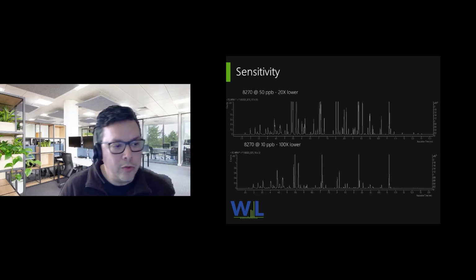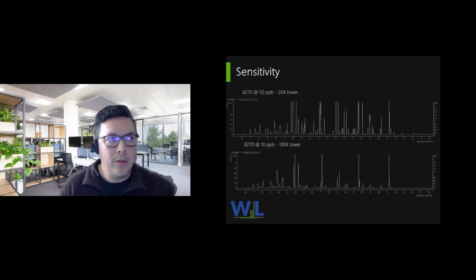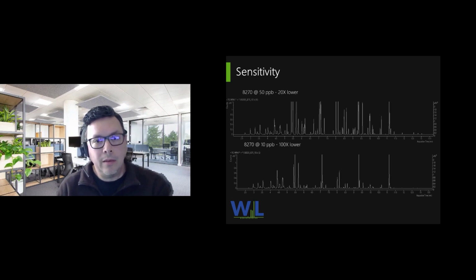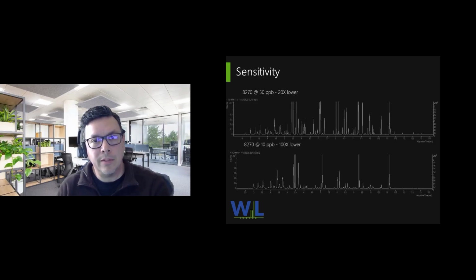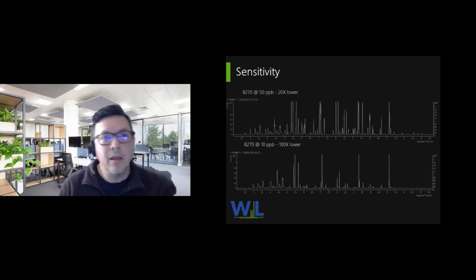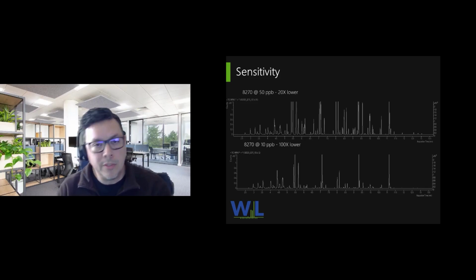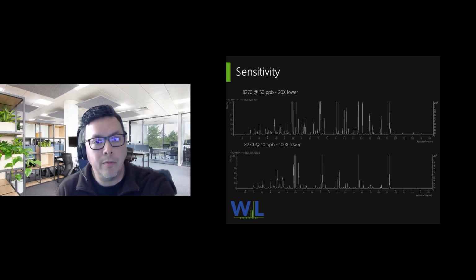And to circle back to the DCM band, we would need to use less methylene chloride, but we would also need to decrease the sample mass, or the mass that we're using. Using the column, having the ability to see 20 times lower, 100 times lower, really opens up a lot of opportunities, a lot of things that we could do, and methods that we could analyze at a lower level.